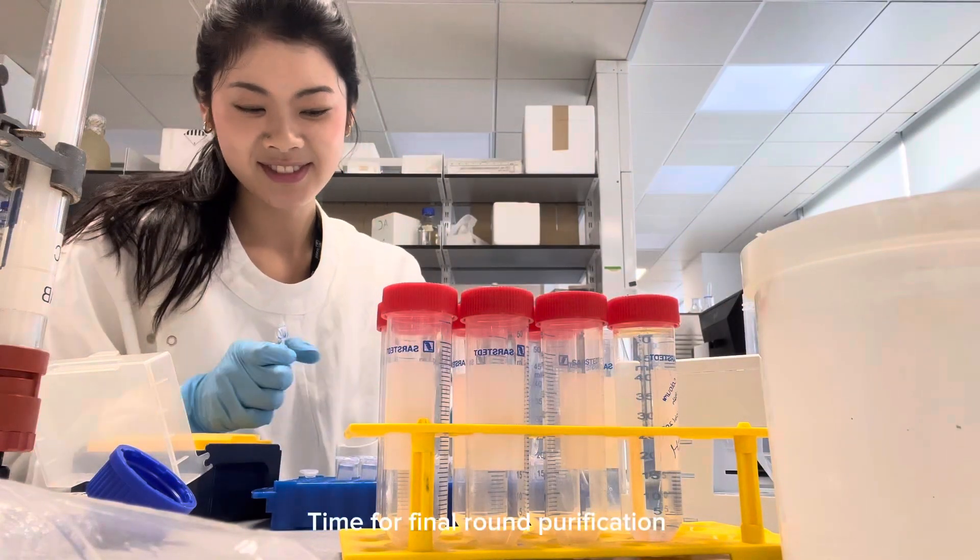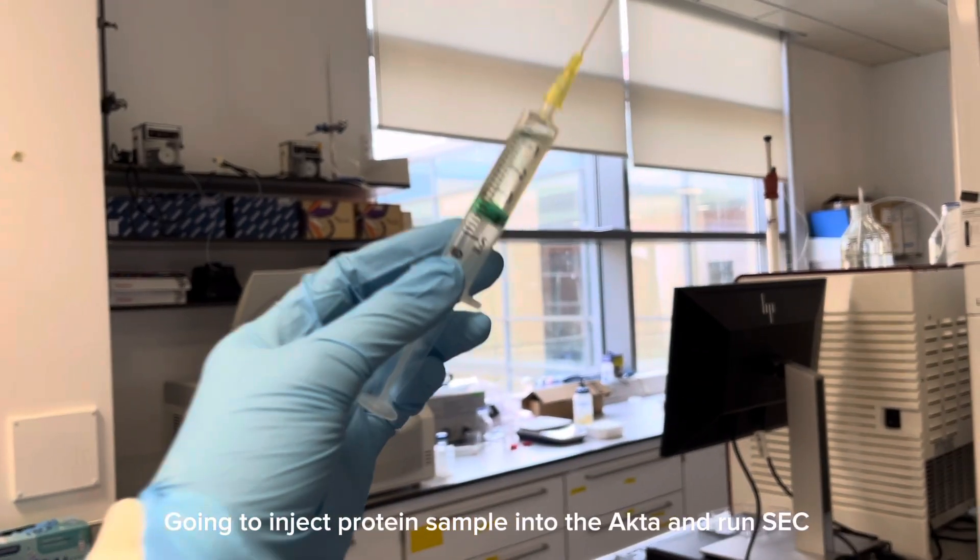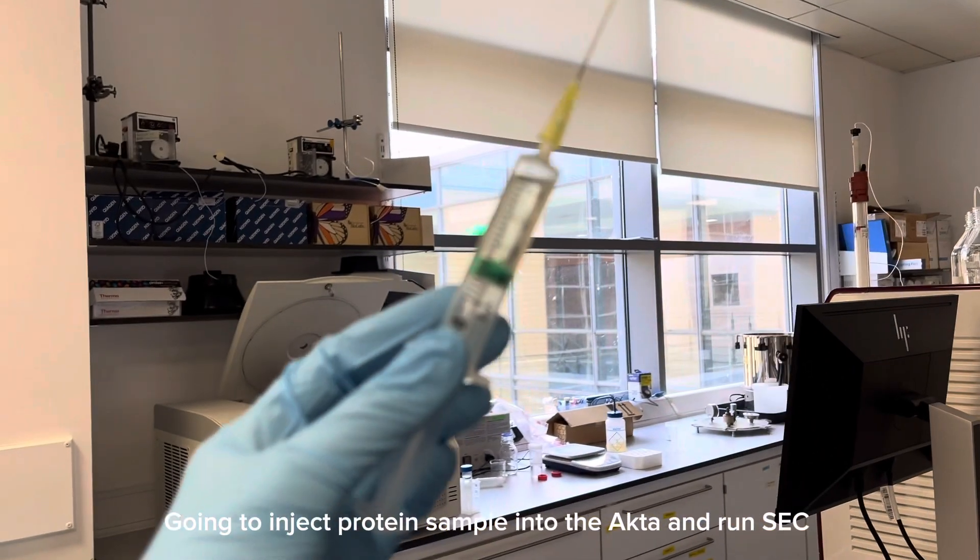Now it's time for the final round of purification and I'm going to inject the protein sample into the ÄKTA in order to run the SEC column.